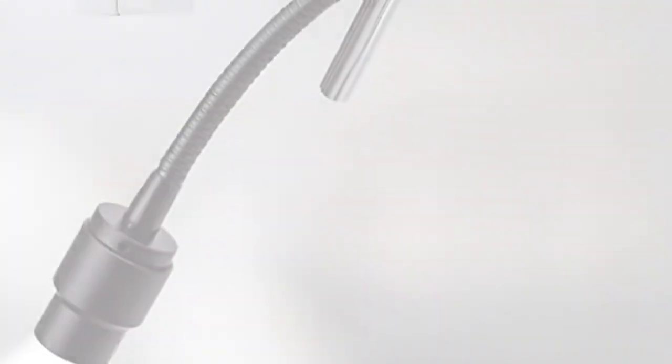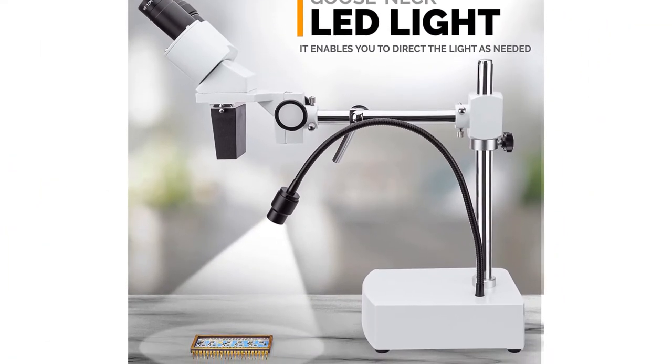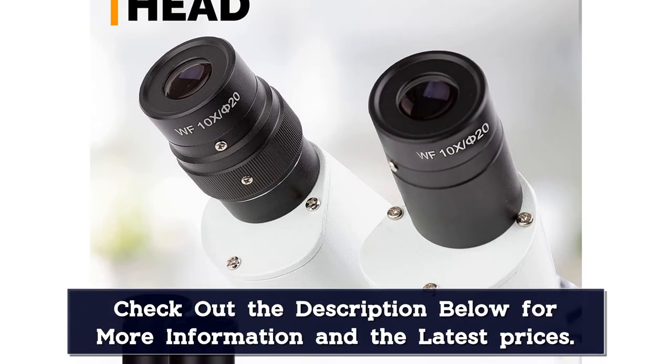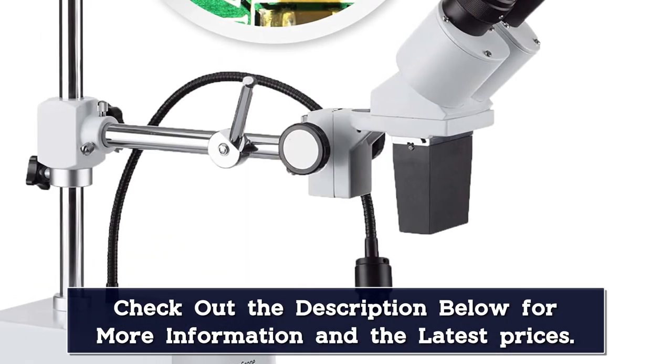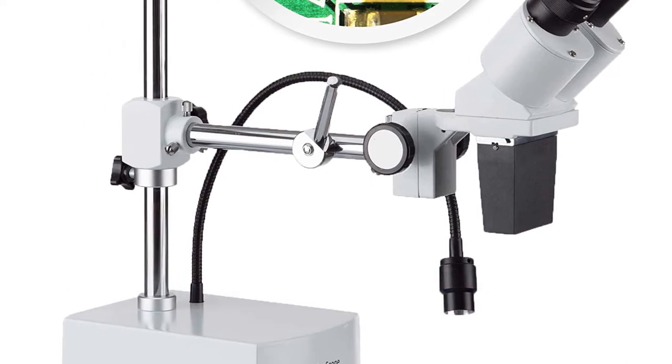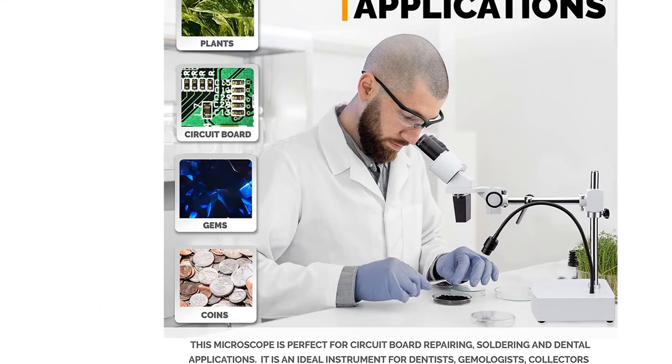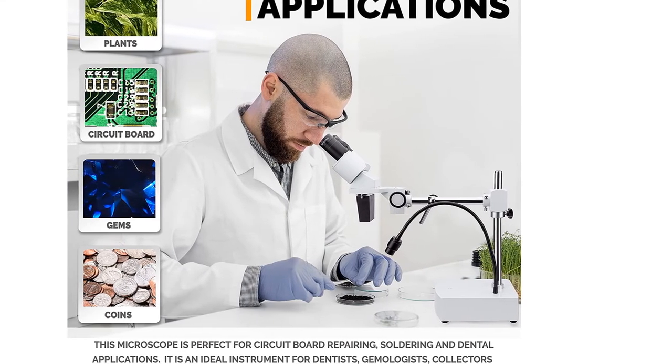Professional stereo microscope with boom arm has long working distance to enable users to perform work or manipulate large items, including circuit boards and dental appliances. Adjustable gooseneck LED light enables users to direct the light where needed. 9 inches vertical working distance and adjustable 12 inches boom arm enables users to adjust microscope on the X and Y axis. 1x objective provides low magnification and longer focal length for inspecting large-scale specimens.